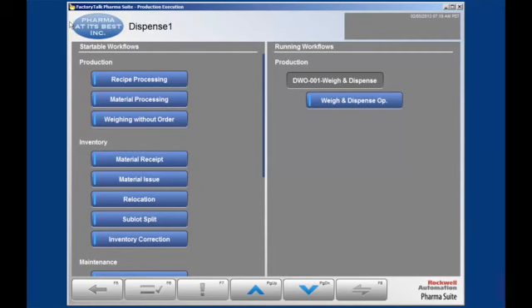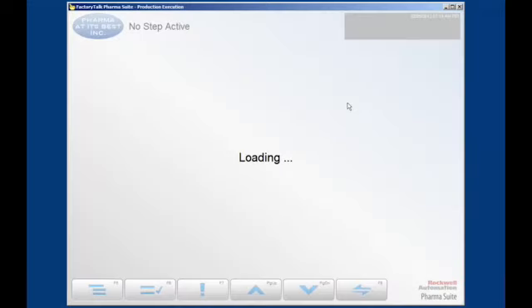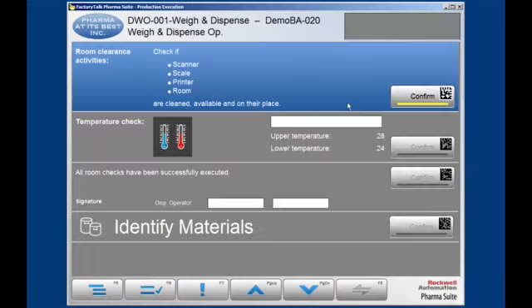We are in the weighing booth, working with the Production Execution Client. The blue button, displayed below the order step, corresponds to the first operation we have to execute. The operation contains several phases, with the system simply driving us through them all. This ensures the weighing process will be properly performed. Selecting this blue button tells the system to show us the first phase we have to execute. Please remember, this workflow is not fixed and is only an example on how the system can provide guidance to the operator. Back to our example.